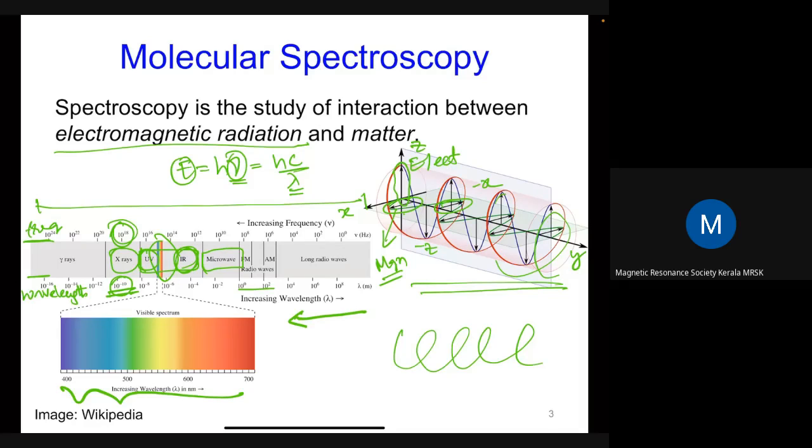Next comes the interesting set of energy range, which is very useful for us. And this is exactly where NMR operates. I'm sure all of us are familiar with listening to radio stations, FM radio and AM radio. AM radio is nowadays less popular than FM. I'm sure all of you listen to the FM radio. Here, I would like to emphasize that nuclear magnetic resonance or magnetic resonance imaging spectroscopies or imaging processes end up using these radiations, the radio waves, which are of very low energy, which end up giving the necessary EM radiation.